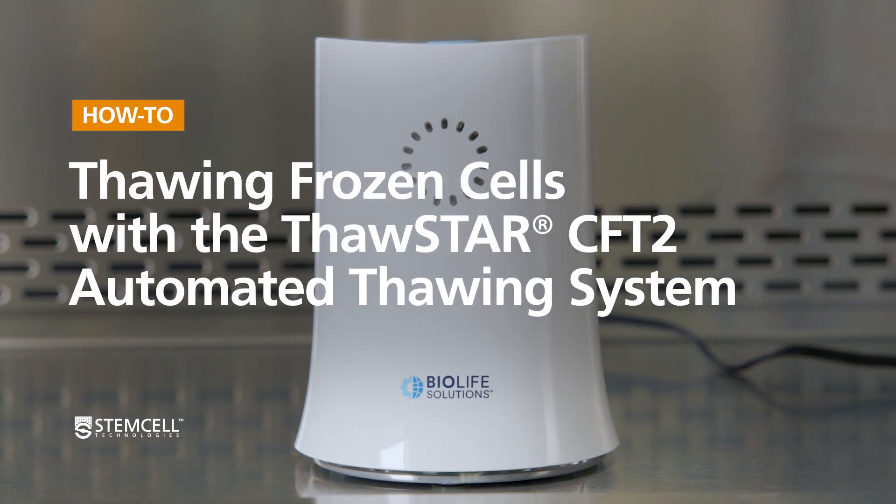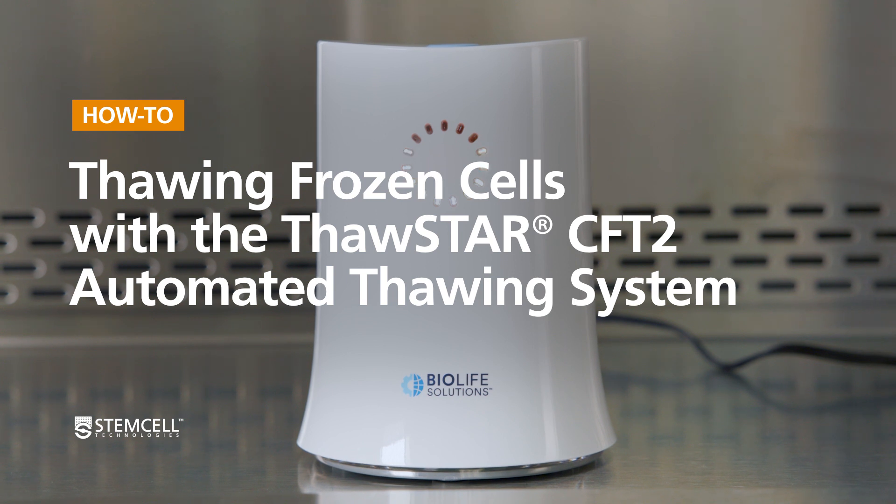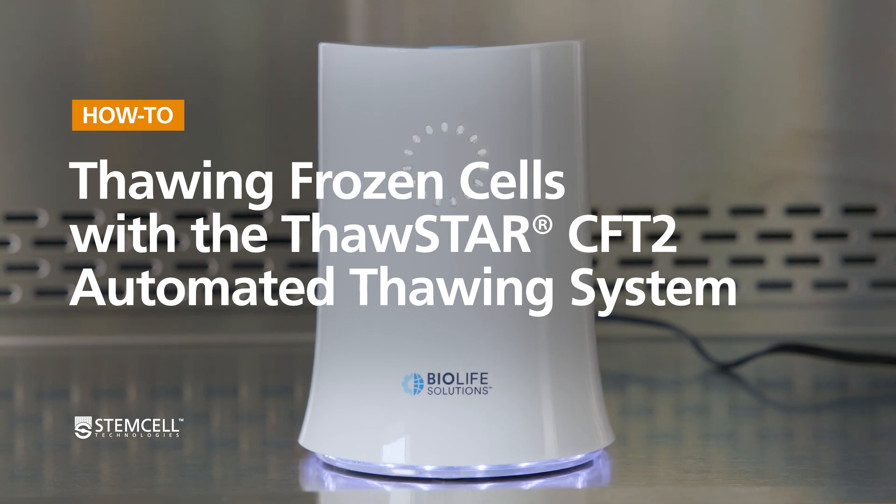Thaw your frozen cells in as little as 3 minutes using the Thawstar CFT2 automated thawing system, an alternative to water bath-based methods.